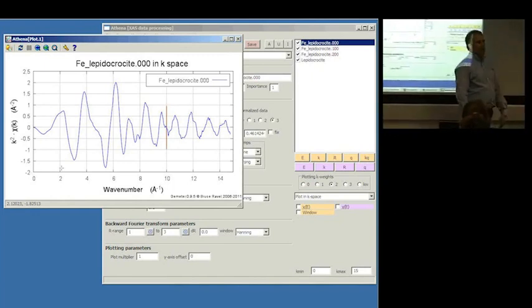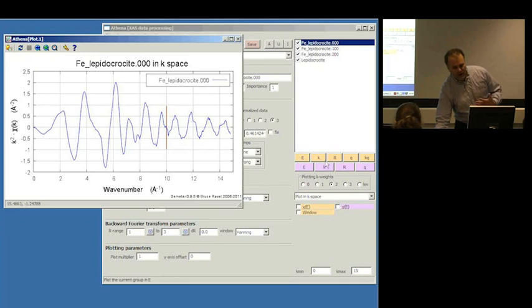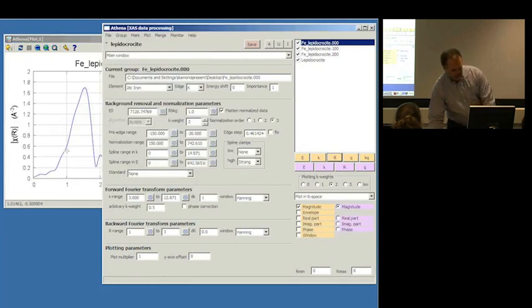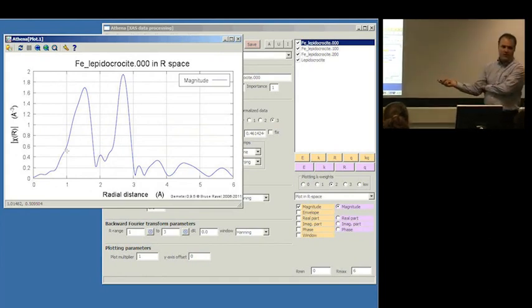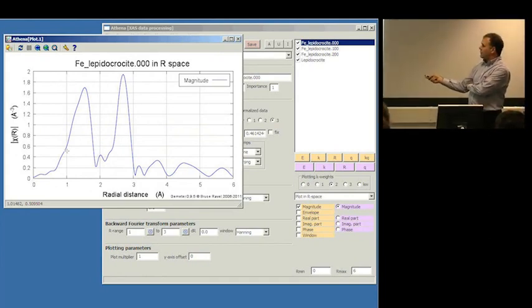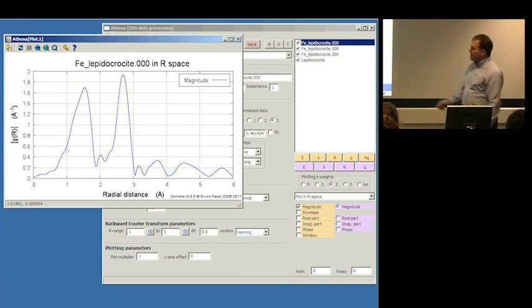And we do this Fourier transform, and we see that there is a dominant frequency. This is the dominant frequency, and then the higher frequency was this one, and there are indeed some other frequencies in that data. And the thing we're going to learn about tomorrow is that this data can be interpreted in structural terms.